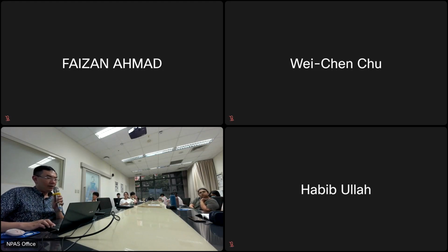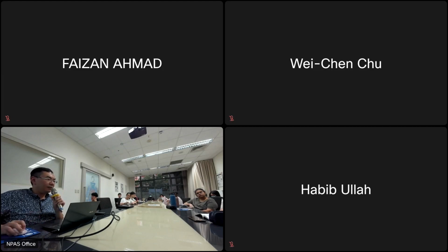After we have a perfect mask, we can perform connected component analysis. The left-hand side is a mask. We can fill a value for the neighboring pixels of each object, like this.